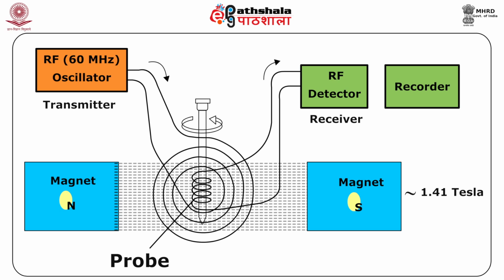One coil is attached to an RF generator and serves as a transmitter. The other coil is the RF pickup coil and is attached to the detection device. Since the two coils are orthogonal, the pickup coil cannot directly receive radiation from the generator coil. One coil supplies a constant RF frequency and the second coil detects the RF emission from the excited nuclei as they relax.